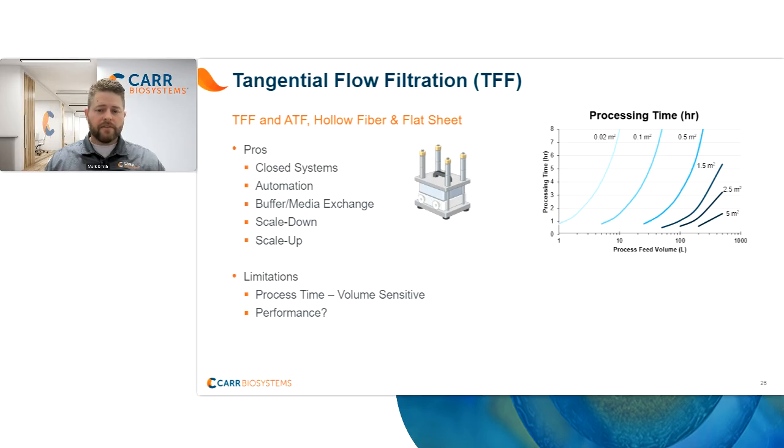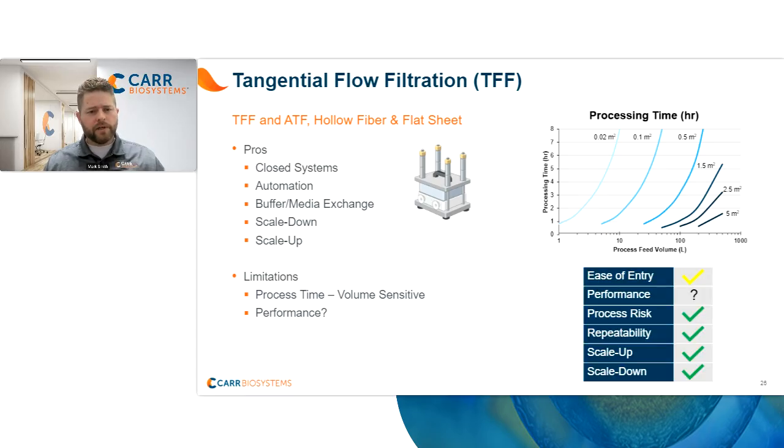And that means that if you go from 1 to 2 liters, you're doubling your time. 1 to 3 liters, I should say, you're tripling your time. But then if you go to the next stage, you may no longer have the same processing time. And if having an equivalent processing time on scale up is critical to your process, that can be a bit of a challenge.